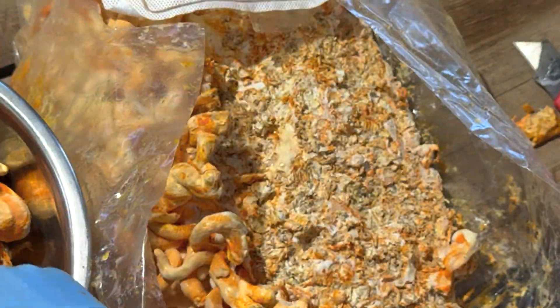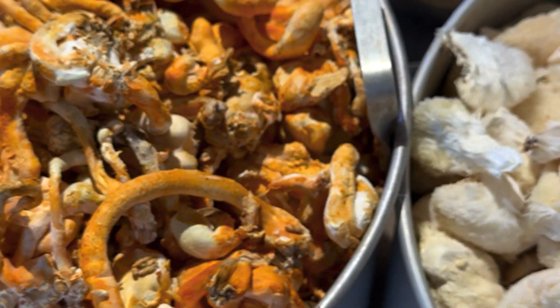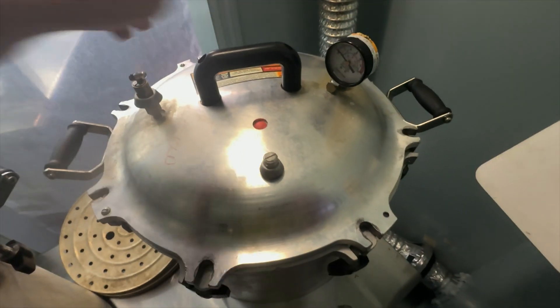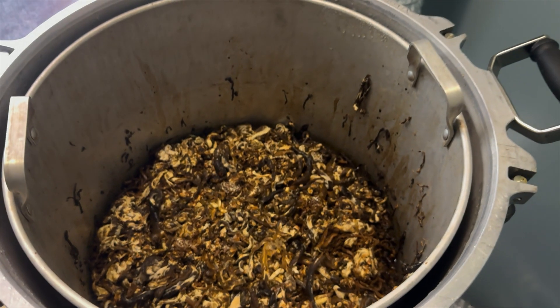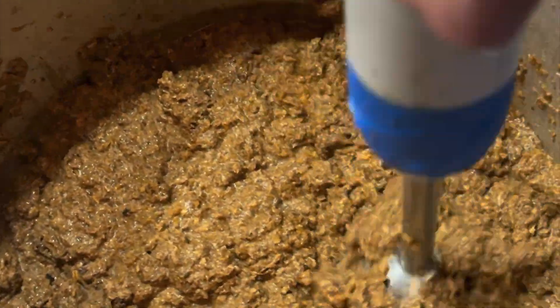We're going ahead and processing that for this batch of medicinals. Everything is picked and ready — we got them in the autoclave buckets. We'll pressure cook that to make it bioavailable for our medicinal powders, comparable to an alcohol extraction, then grind and blend it to get all the nutrients into the powder.